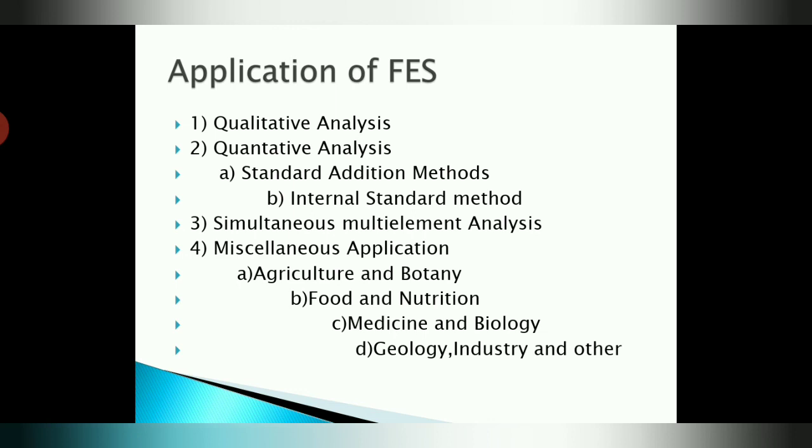Next, in the field of medicine and biology, FES plays an important role in the determination of sodium, potassium and calcium in body fluids, and this technique can similarly determine other elements like magnesium and copper. The last one is geology, industry and others. The flame emission spectroscopy is useful in this particular field also.